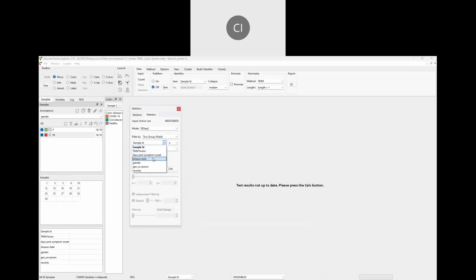And then I will use disease state, and I will take COVID against those that are healthy. I will skip the convalescent, that's just one sample here. But otherwise, you can, of course, use that, or you can omit it like I did in this case in the test here.